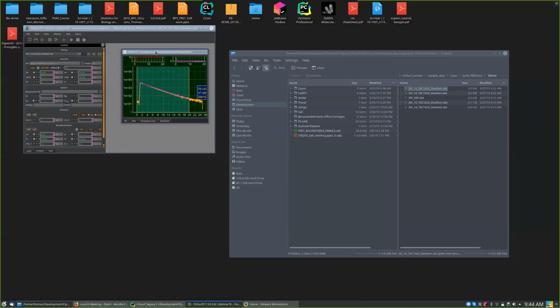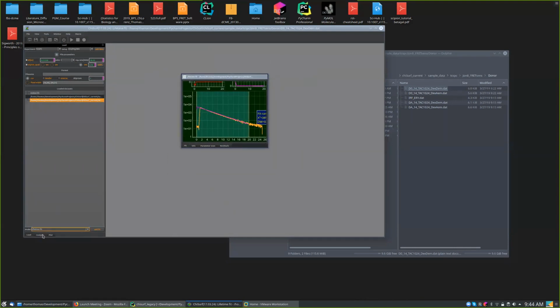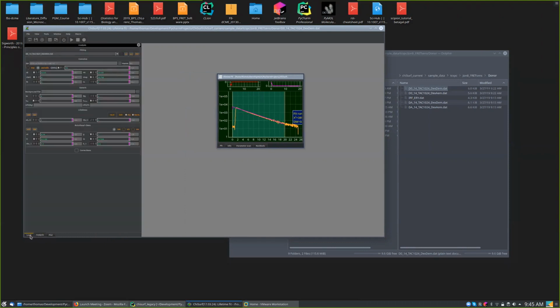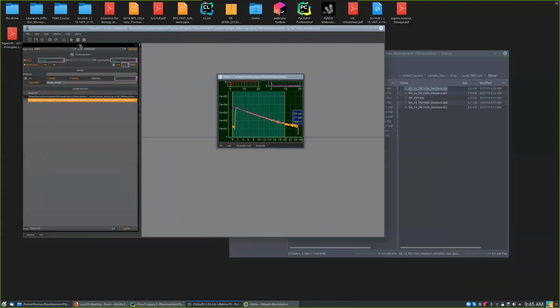Okay, here, so you click here on the data, you select the model, you click on add fit, and then on your window here to the right, you get displayed the data. So here to the left, there are multiple panes, where you can click. Like here on this loading window, you can also click here to the top and move it somewhere else in principle. On the loading window, you can load the data.